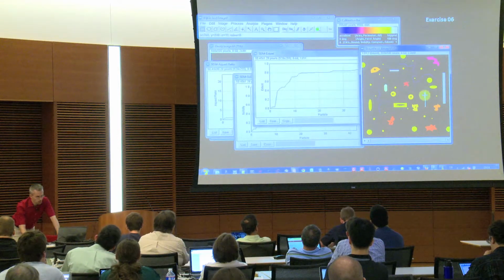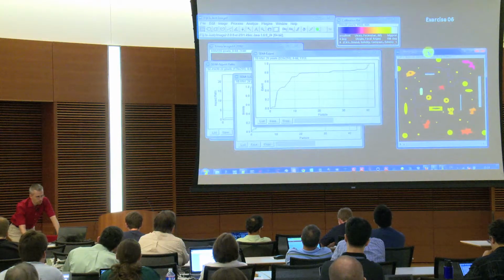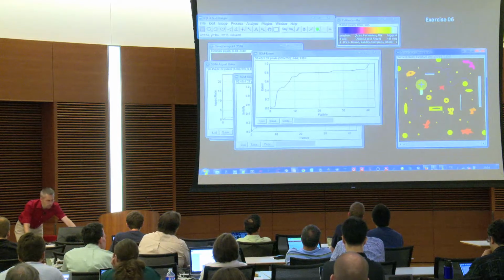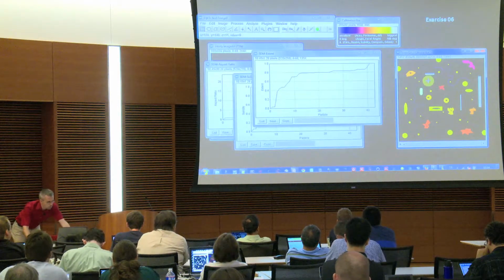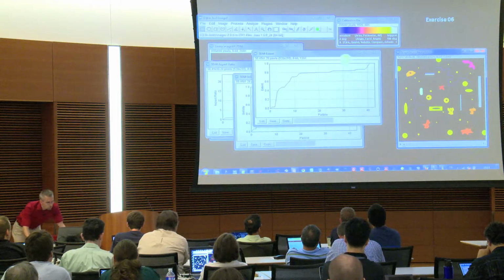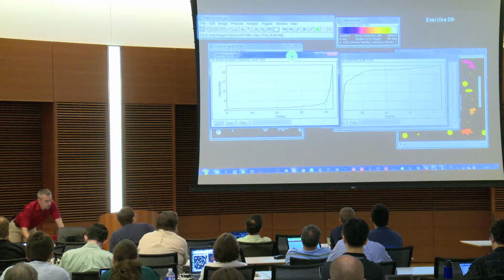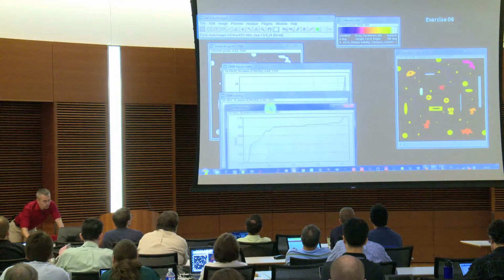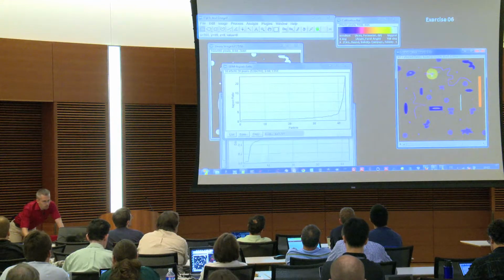Where in extent you see that those 3 ones, or potentially in addition to that, have a high solidity. So first of all, now I press escape and cancel that thing here, then I get the results table. Okay. And then I'll have a look at that. If I want to use the aspect ratio, for example, I could normally extract those 3 ones.